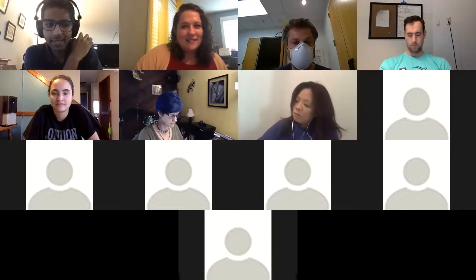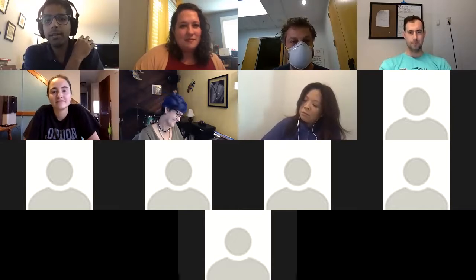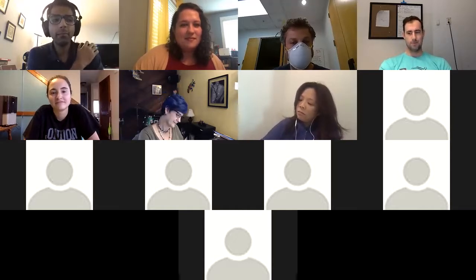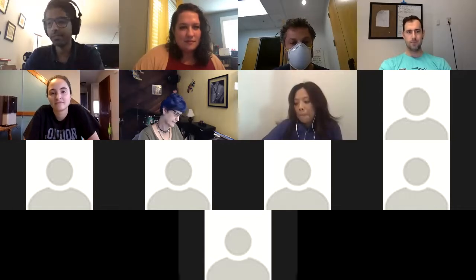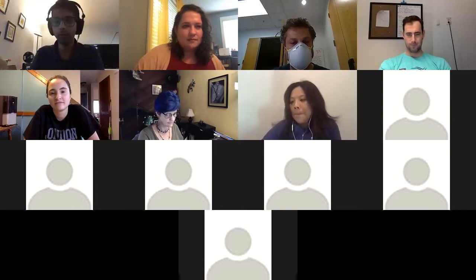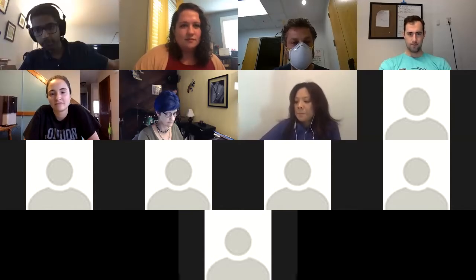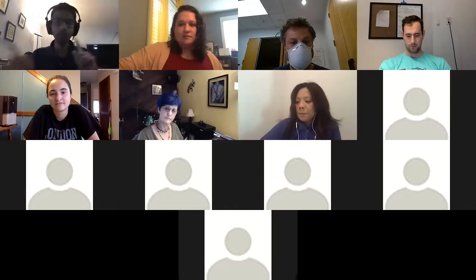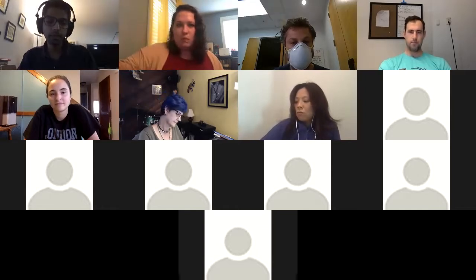learned, I think, is effectively dealing with people. Because I feel like electron microscopy is often a little more collaborative than a lot of other branches of science. Just the nature of research groups is like, somebody in that research group comes and gives you this crystal. You make a sample, you look at it in the TEM. So there's always this back and forth between different research groups.